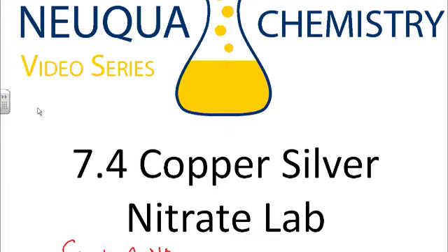We're going to get silver, and we're going to then combine copper and nitrate together. Well, the problem we have is that copper is a transition metal, and we don't know what transition metal it is, so we don't know what our formula is going to be. So you're going to be kind of finding that X and that Y by doing this lab.